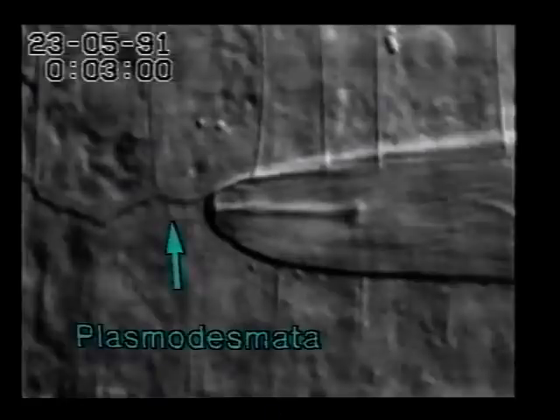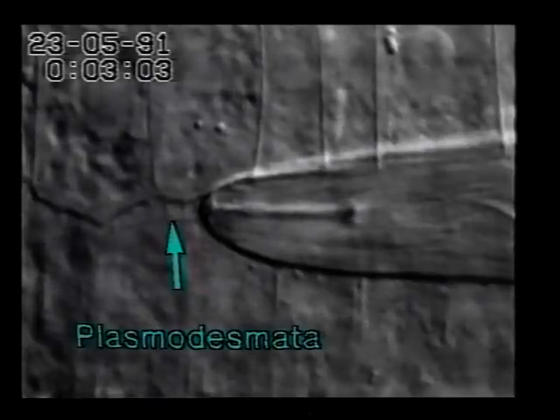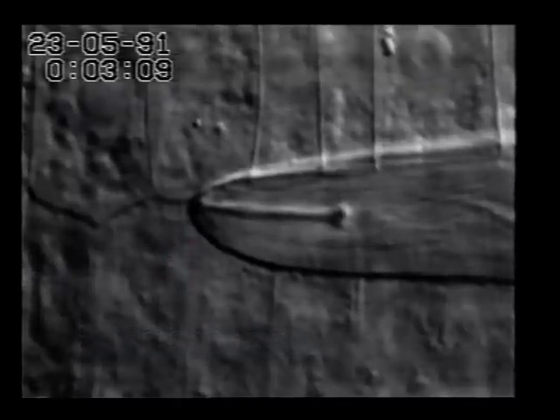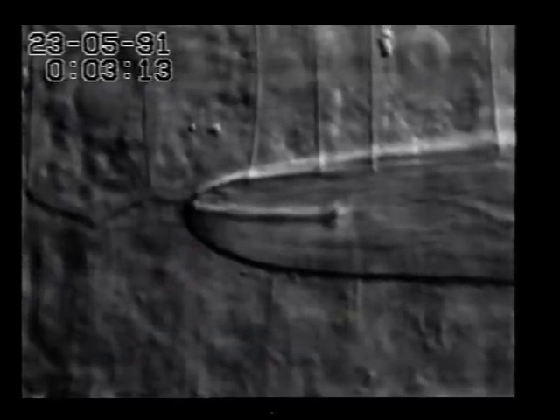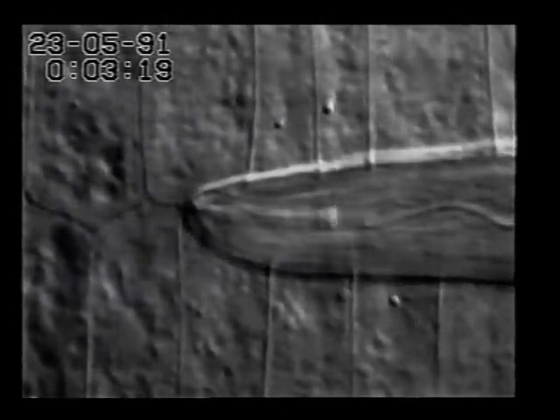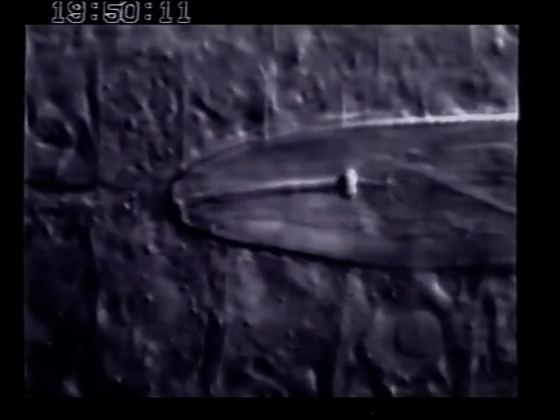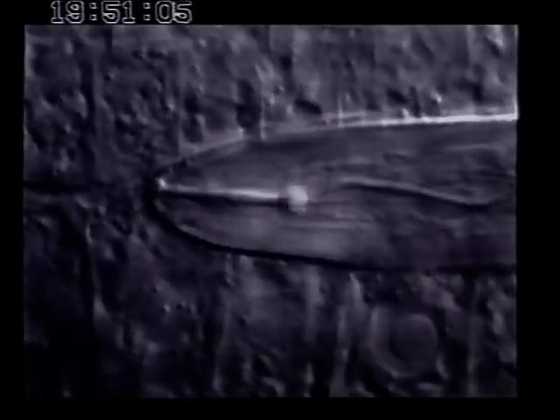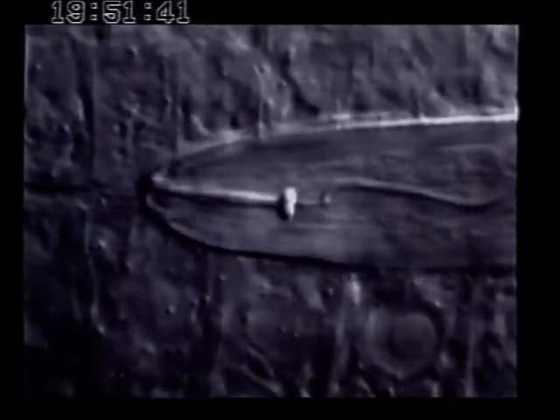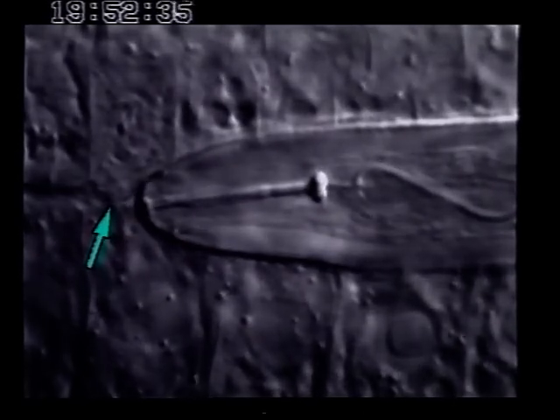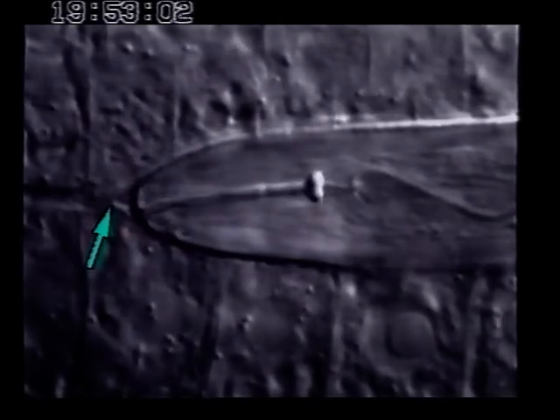At higher magnification, some more details become visible. The intercellular space is widened by the juvenile and the cytoplasmic links between the cells, the plasmodesmata, are first stretched and later interrupted. The widening of the intercellular space is achieved by subtle movements of the head end. The arrow points to fluids pushed forward toward the intercellular space in front of the nematode.